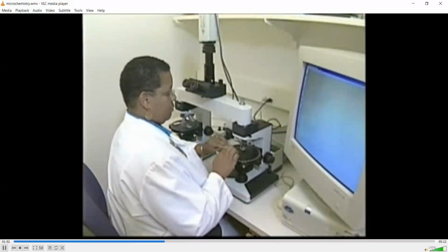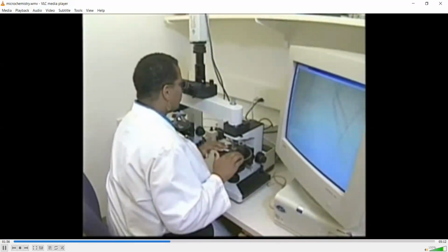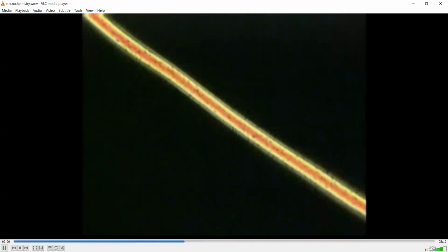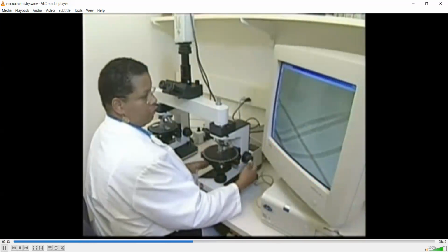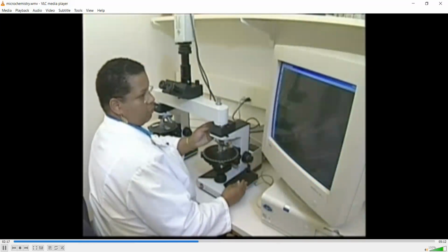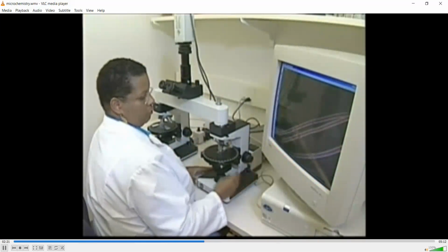Fibers often play an important part in the solution of a criminal case. Fiber evidence is placed under the microscope and exposed to polarized light, that is, light coming from one plane only. Comparing the speed of light through air with the speed of light through the fiber establishes the refractive index of the fiber. Using this instrument allows precise examination and comparison of fibers found at the crime scene with fibers found on or associated with a criminal suspect.